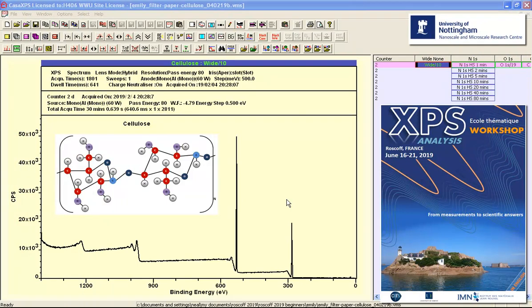In this video we are going to look at the concept of detection limit and how this applies to a given measurement from a given sample. The sample is cellulose so we expect to see oxygen and carbon and we do.